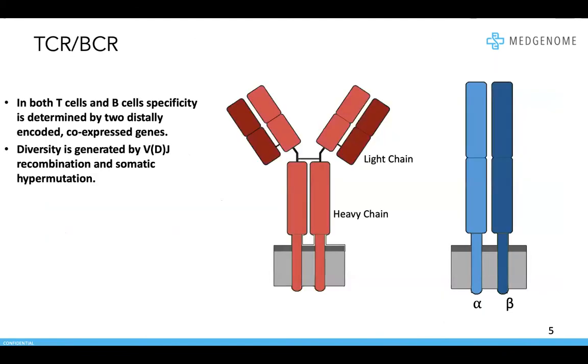So I'll start off by talking about immune profiling. A large portion of our clients work in areas related to immunology. So the use of single cell sequencing is critical for the deep understanding of the immune system. 10x Genomics can be used to deconvolute immune system heterogeneity. It allows identification of rare and distinct immune cell subsets, which can be used to build development trajectories for immune cells and more.